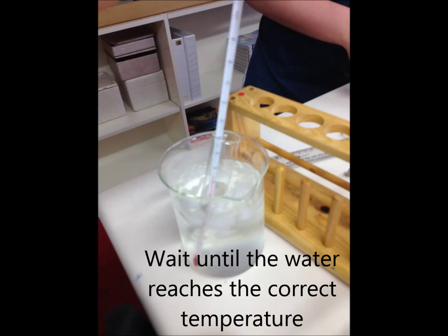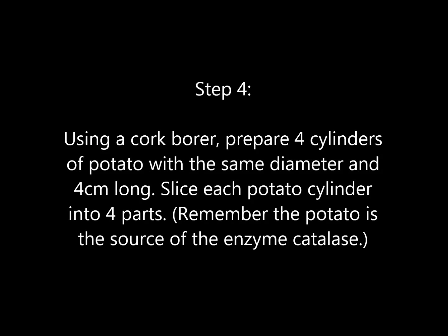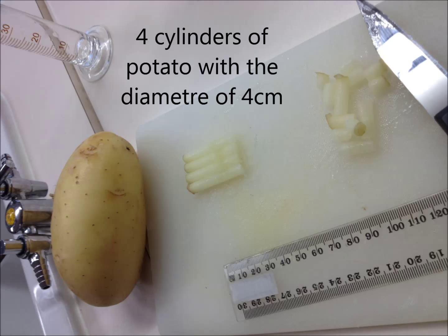Step 4. Using a cork borer, prepare four cylinders of potato with the same diameter and four centimeters long. Slice each potato cylinder into four parts. Remember, the potato is the source of the enzyme catalase.